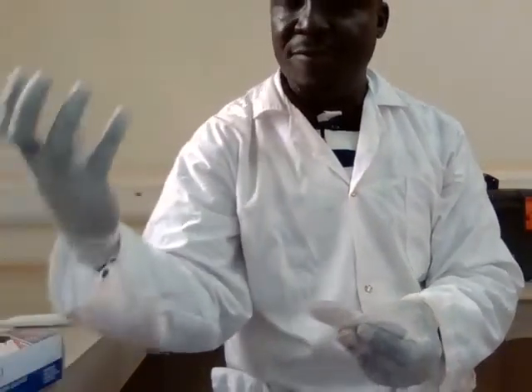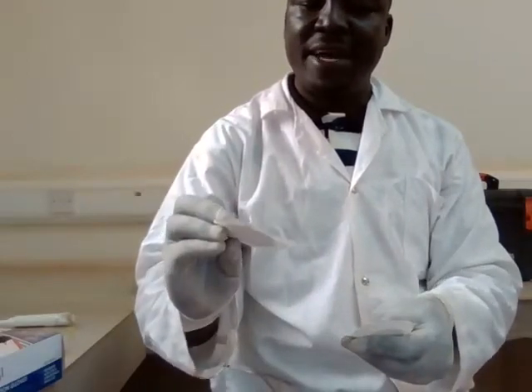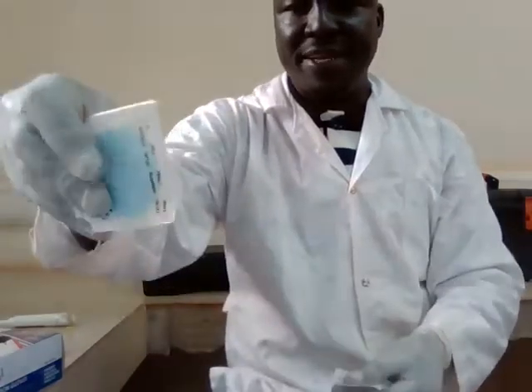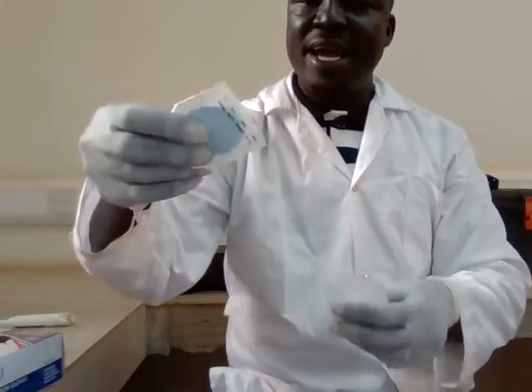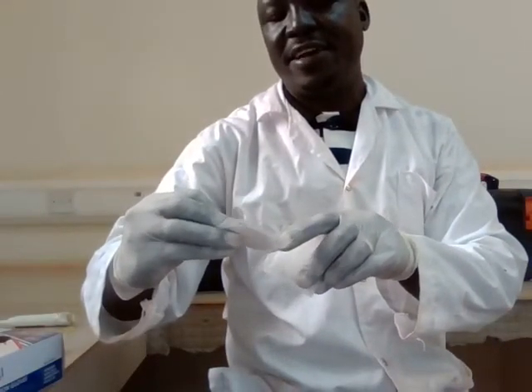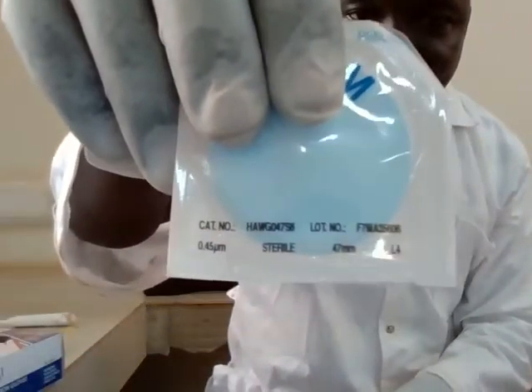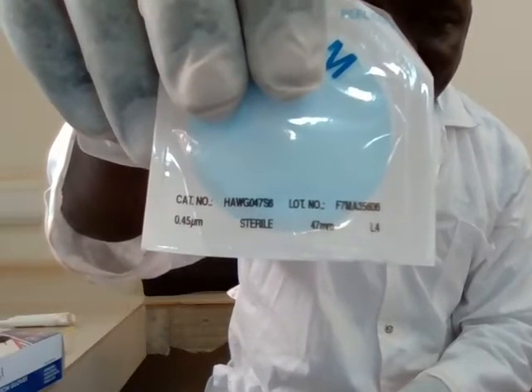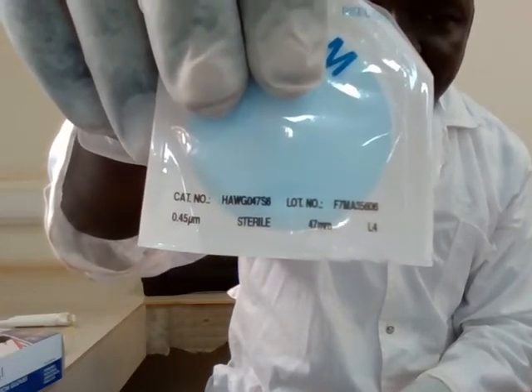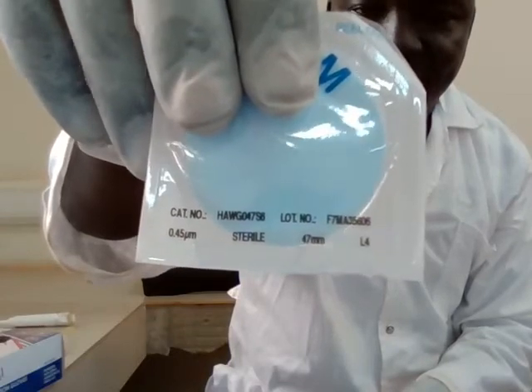Actually, it absorbs the food for the microorganism, and then these are sterile membrane filters. They have specific size and diameter. You can see it here. This one, the pore size is 0.45 micrometers and the diameter is 47 millimeters.